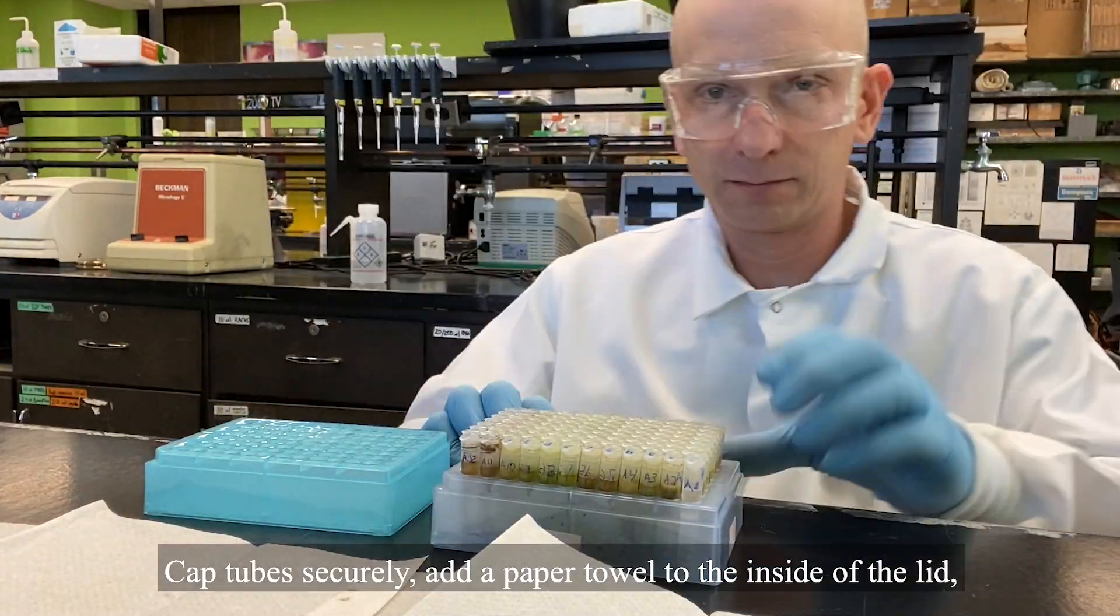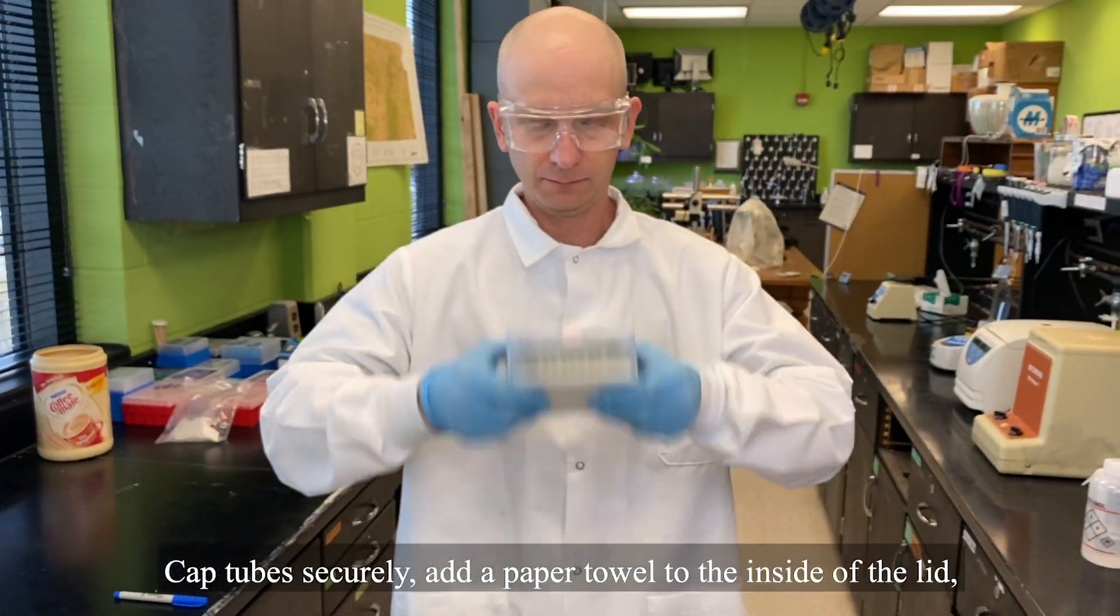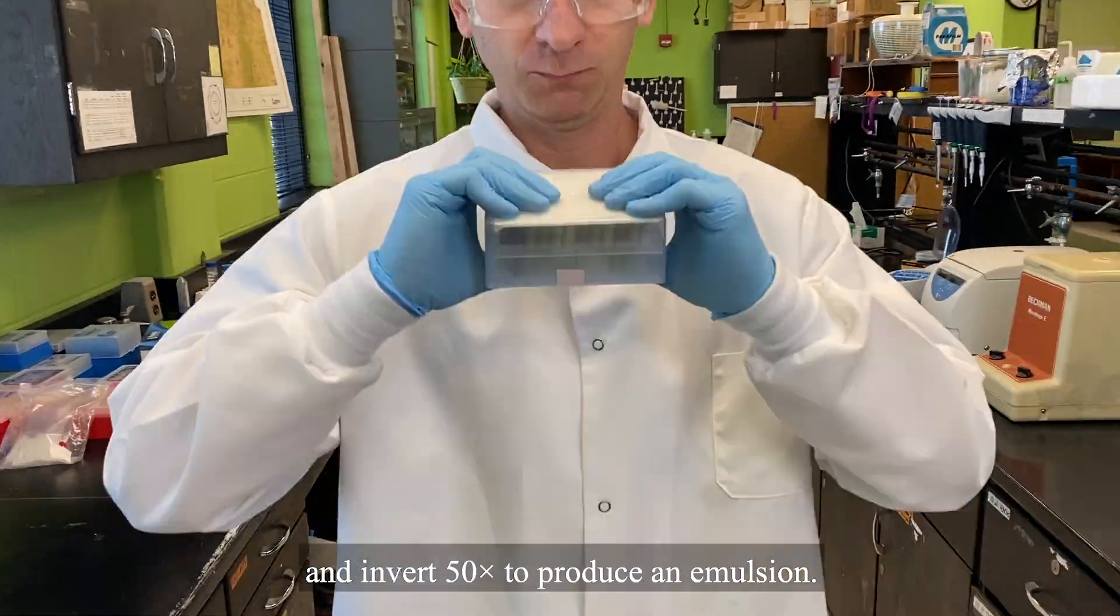Cap tube securely, add a paper towel to the inside of the lid, and invert 50 times to produce an emulsion.